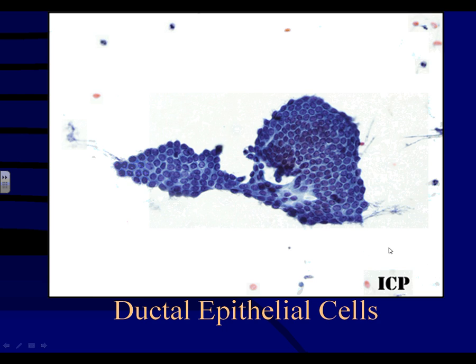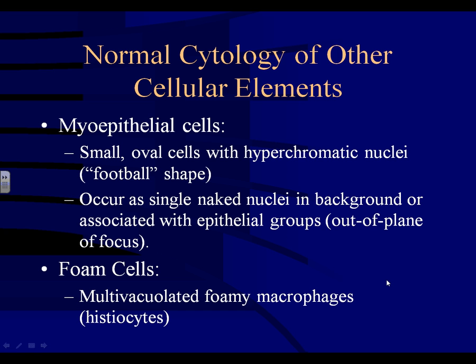Myoepithelial cells are very important to recognize. They are small oval cells with hyperchromatic nuclei, slightly smaller than ductal cells with a football shape. They often occur as single naked nuclei in the background without cytoplasm, or they can be associated with the ductal epithelial groups — you have to focus out of the group a little bit to see them overlying it.